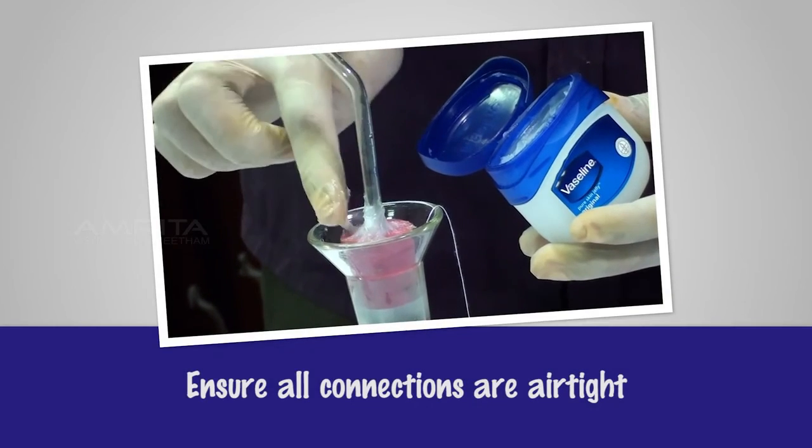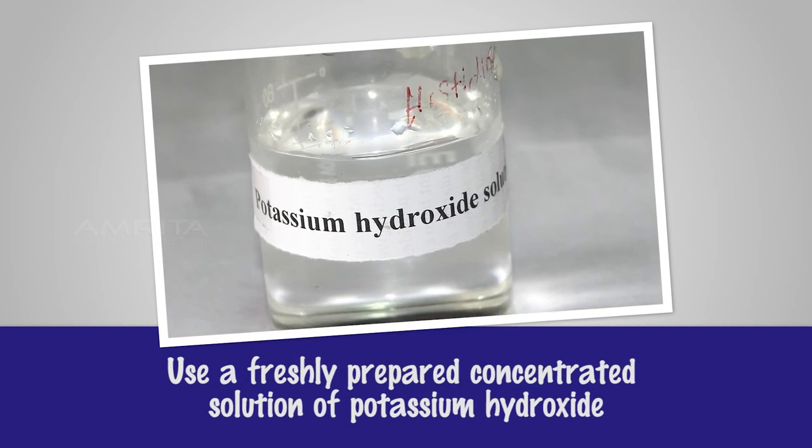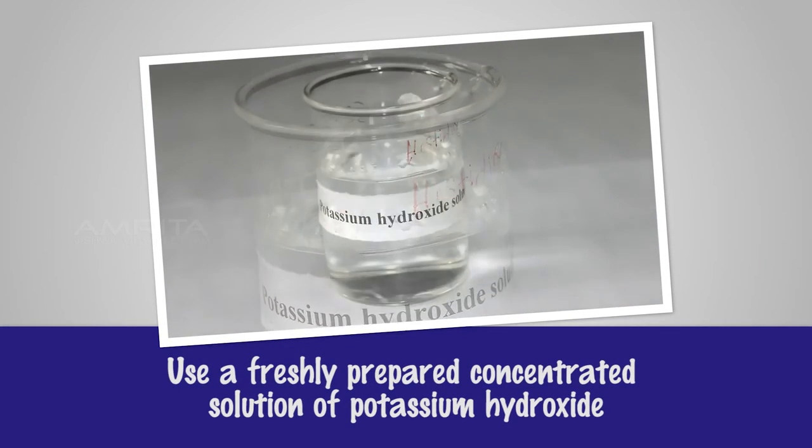Precautions. Ensure all connections are airtight. Use freshly prepared concentrated solution of potassium hydroxide.